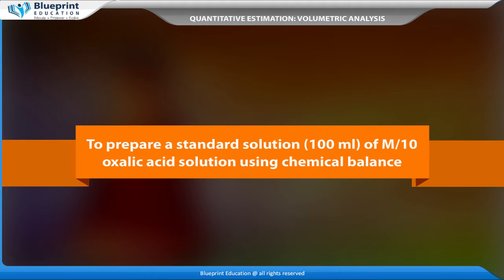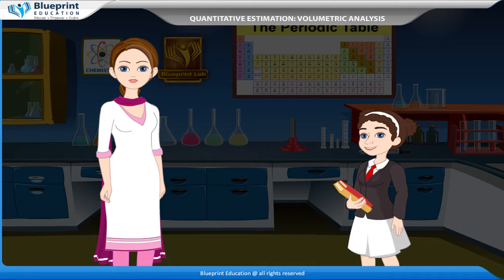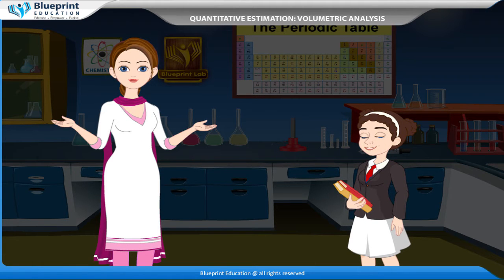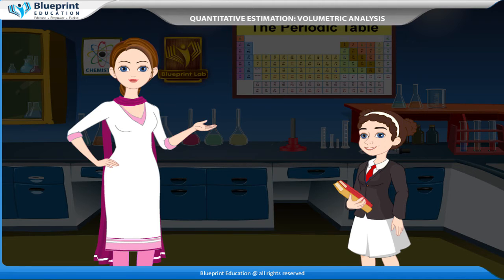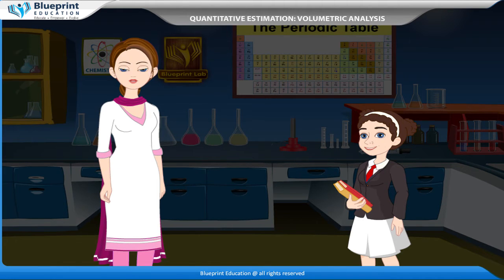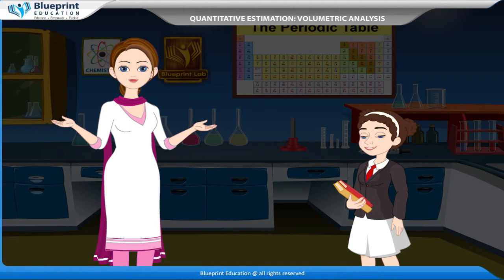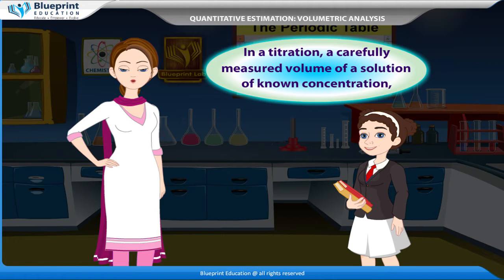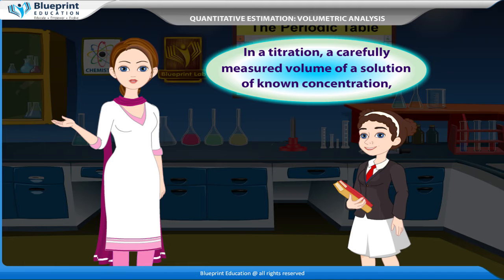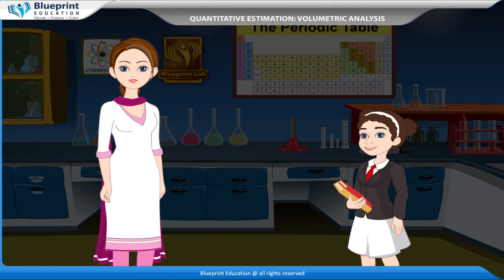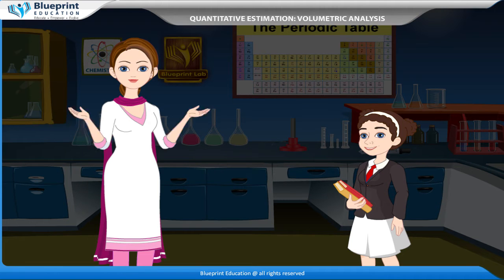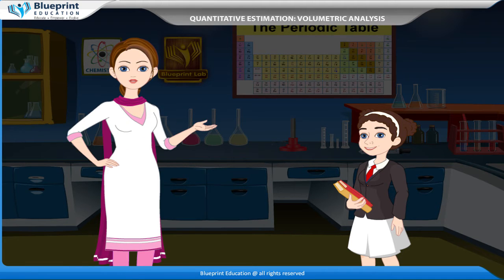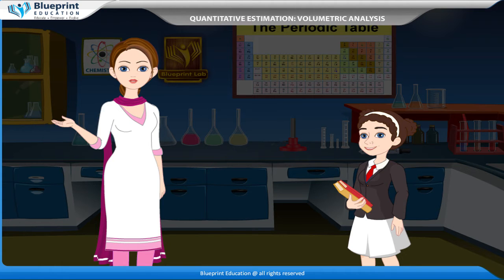To prepare a standard solution of 100 ml of M by 10 oxalic acid solution using a chemical balance. To determine the amounts or concentrations of substances present in a sample, chemists use a combination of chemical reactions and stoichiometric calculations in a methodology called quantitative analysis. In a titration, a carefully measured volume of a solution of known concentration, called the titrant, is added to a measured volume of a solution containing a compound whose concentration is to be determined — the unknown.